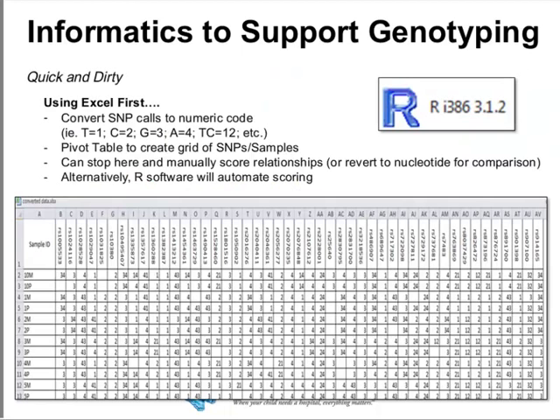Now, to get to that point, you have to do a little bit of Excel jockeying to get the MassARRAY output file into a compatible format for the R program to run it.